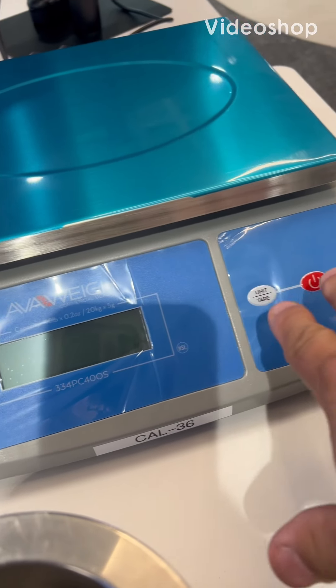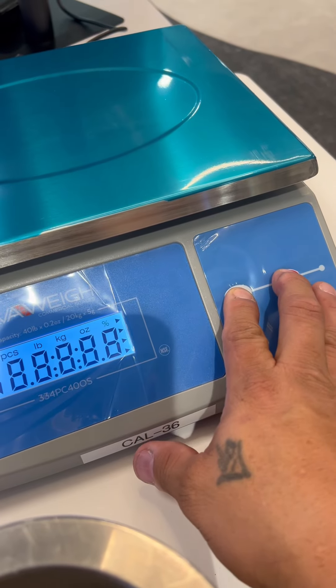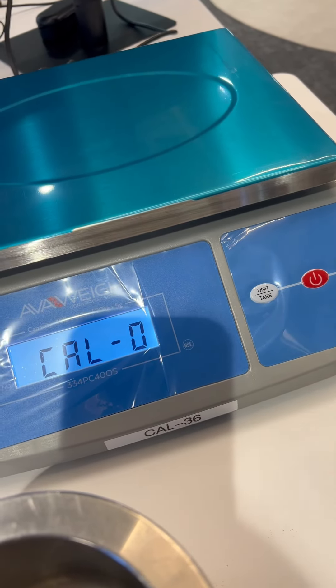So this is how you adjust the calibration of an AVAway. Basically you hold down these two keys until you see cal zero. It's going to do your zero adjustment.